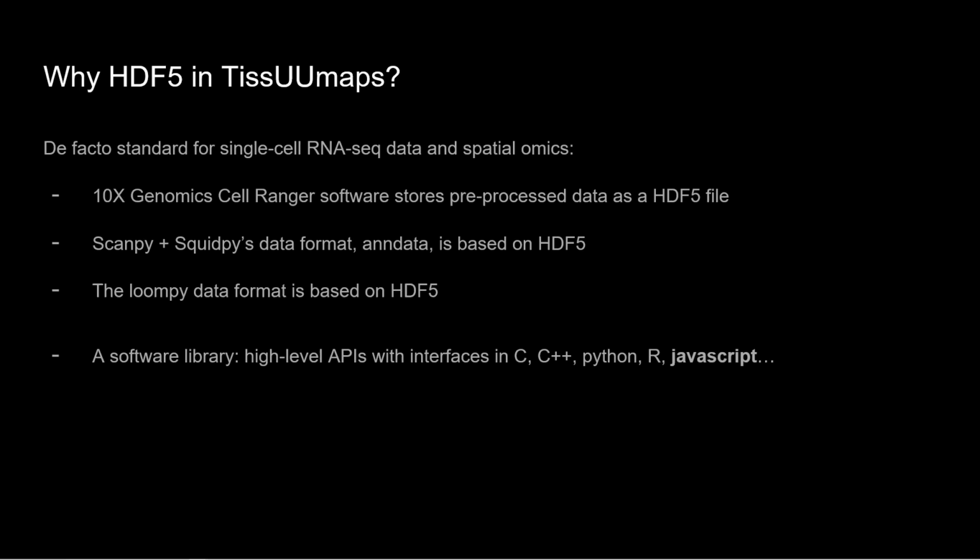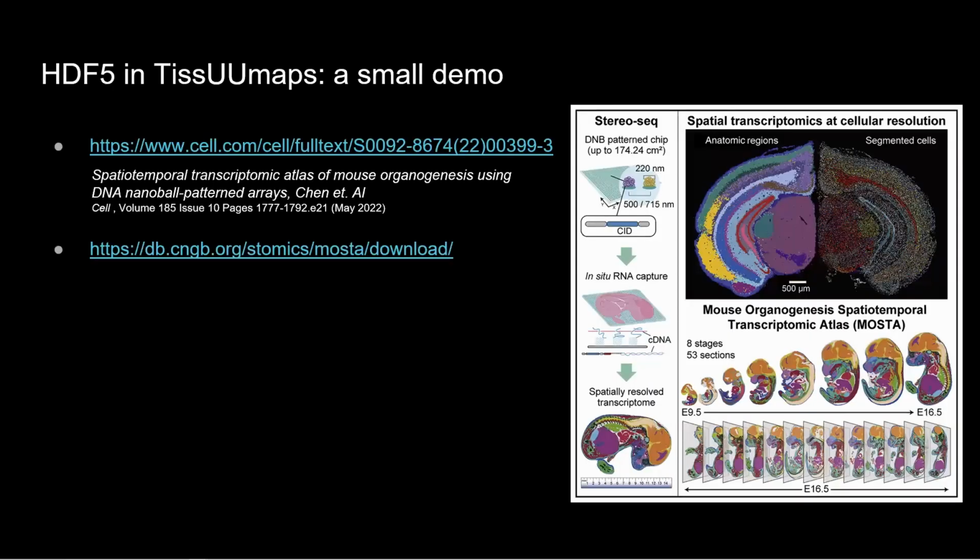Another big advantage is that it comes with a software library. The HDF people develop interfaces to access the data in C, C++, Python, R, and then you have wrappers around these, in JavaScript and so on. We used one called H5WASM that can load files in JavaScript, and I will show you how that works. So let's take an example.